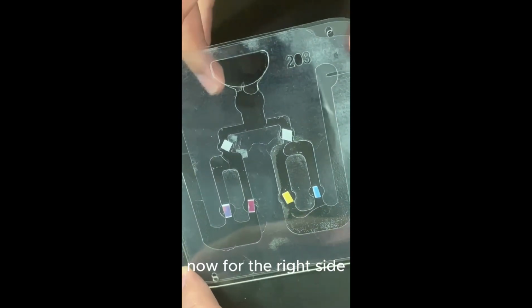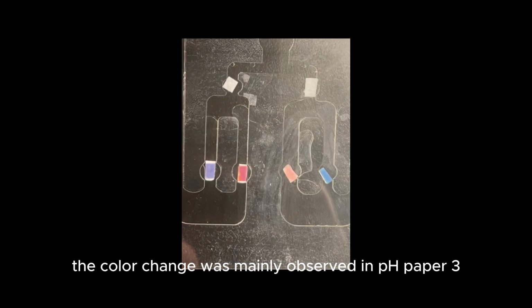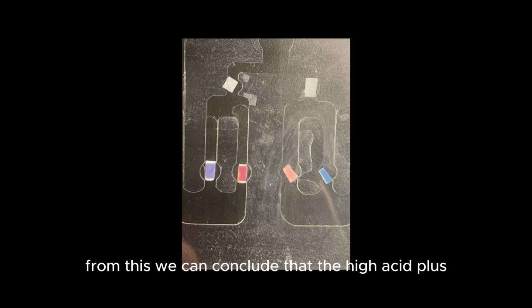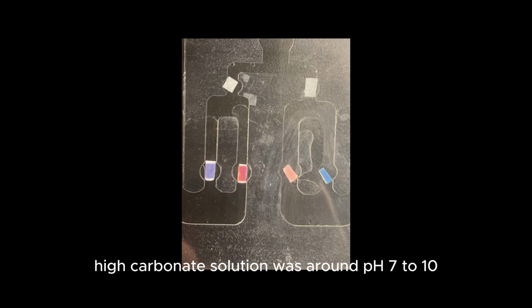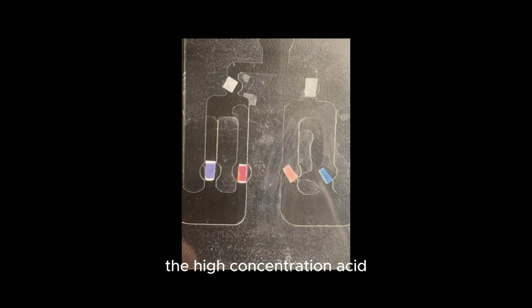Now for the right side, we have pH paper 3 and pH paper 4. The color change was mainly observed in pH paper 3 and not so much in pH paper 4. From this, we can conclude that the high acid plus high carbonate solution was around pH 7 to 10, since pH paper 4 did not change color. With this, we know that the high concentration carbonate was strong enough to neutralize the high concentration acid.